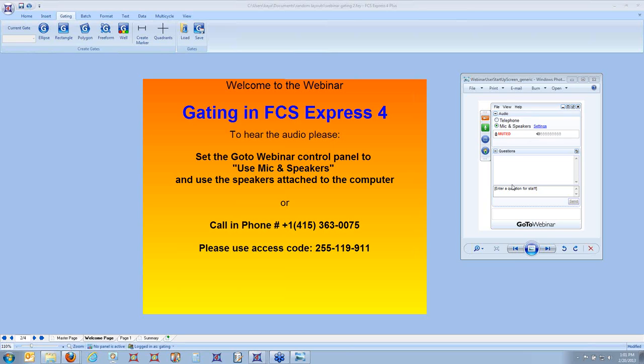We're going to be talking about gating in FCS Express 4. So we're not going to be talking about simple things like inserting plots and that kind of thing, because that's covered in the Getting Started webinar. But even if you don't really know your way around FCS Express yet, just stay tuned. I'm sure you're going to be able to follow everything that we're talking about today.